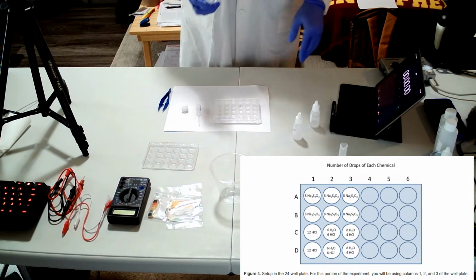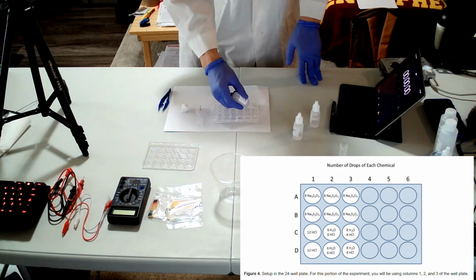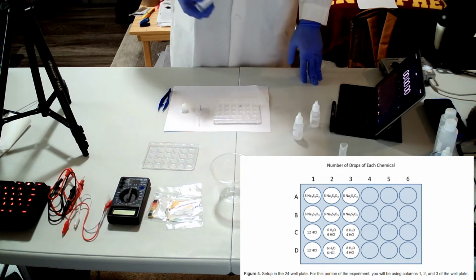And B1, B2, B3 as well, 8 drops each. Okay.